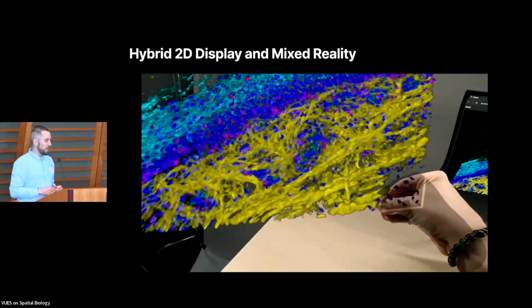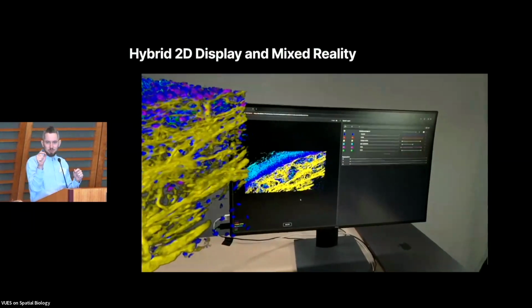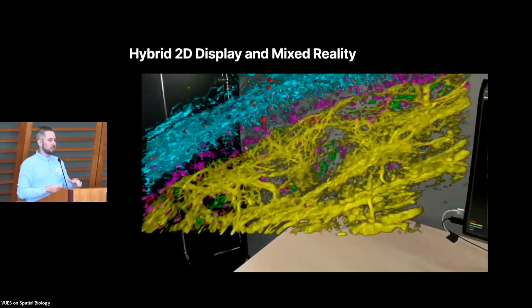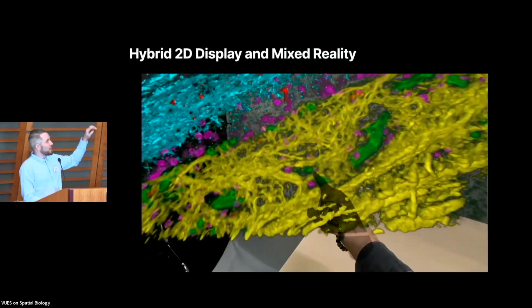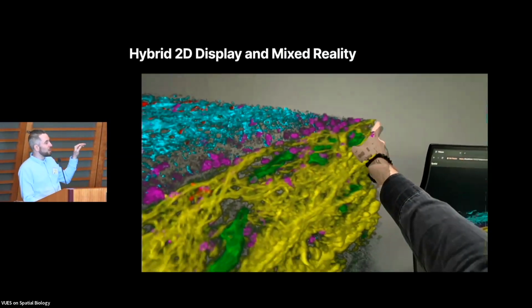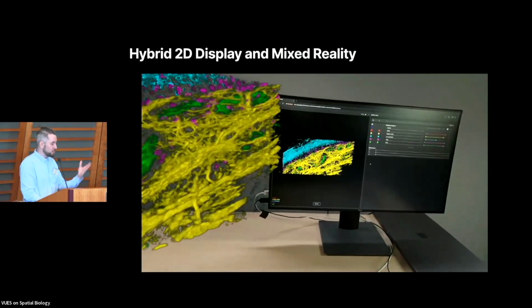And we heard very often that in XR or in virtual reality, it's tricky to do those very intricate movements, or to bring the UI elements over is hard. So the way we approach it is you still use the UI on your PC that you're used to, and it is reflected automatically in XR because the two are synchronized. And what you can see here is that this blood vessel that Clarence highlighted before is actually a continuation of a larger blood vessel going through the collagen fibers. In XR, you can actually see how it weaves through the 3D space, which is super tricky to even see here on the screen. So I invite you also to have the goggles with me. If you have time later on, you can come by and try it out yourself as well.